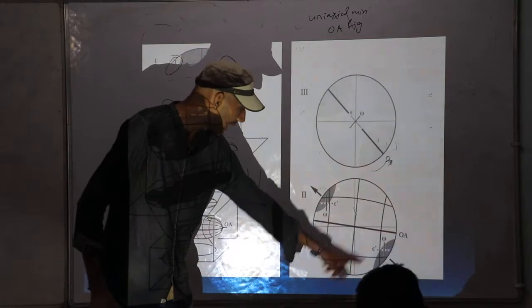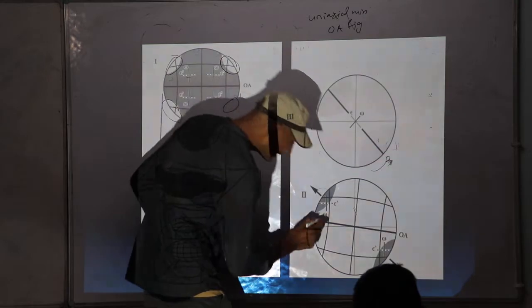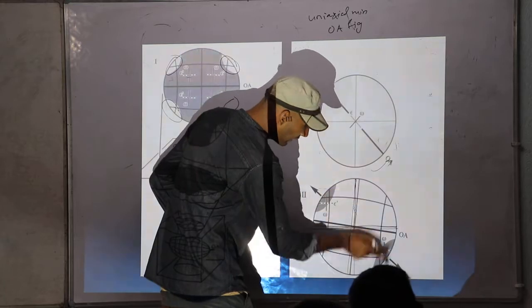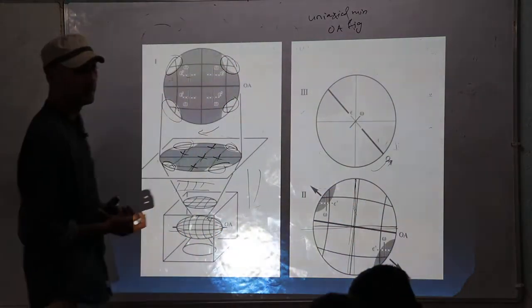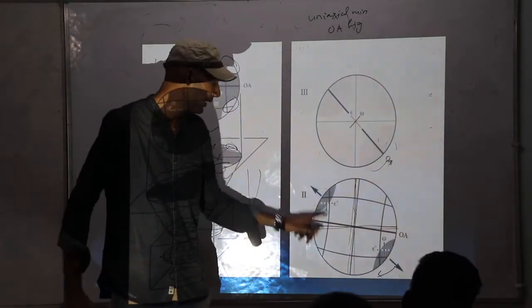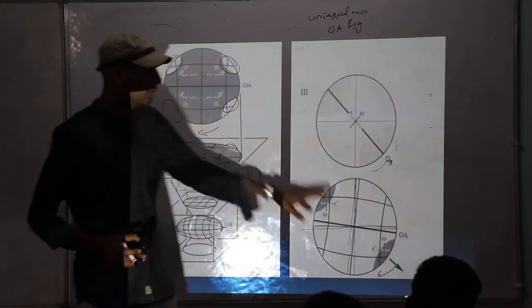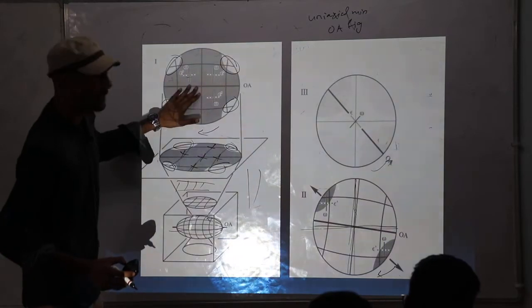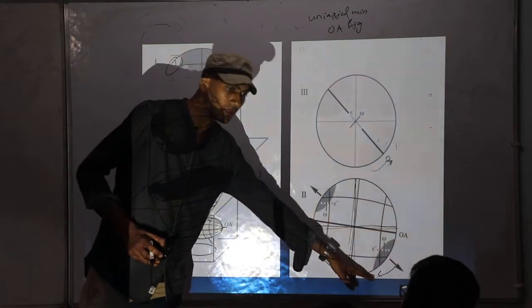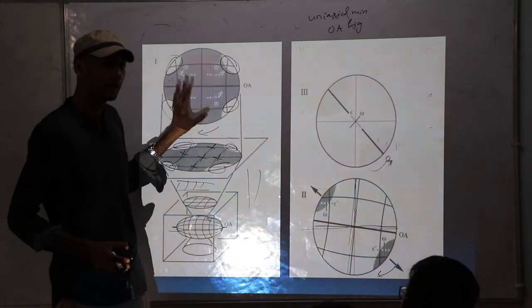You can see these rays are showing vibration of polarizer and analyzer, and all the others are showing vibration direction of the mineral. You can see there is mismatching of vibration in all except these two positions. So this darkness, this extinction, is going to disappear with slight rotation of stage because of mismatching of vibration in the entire section. Got that?